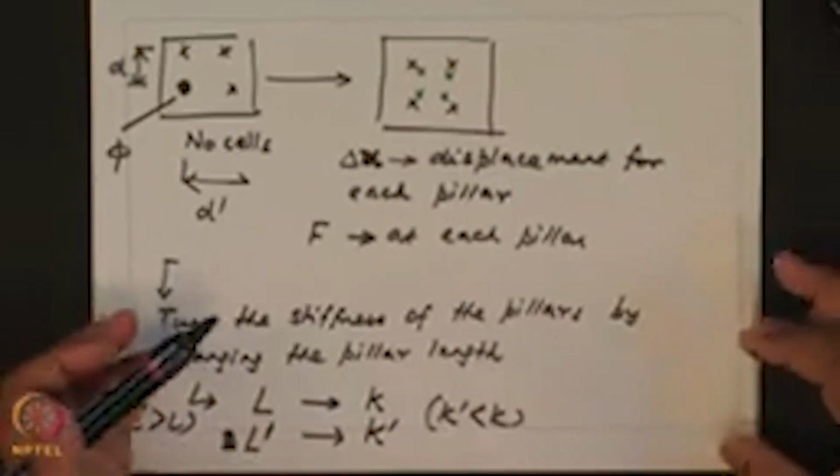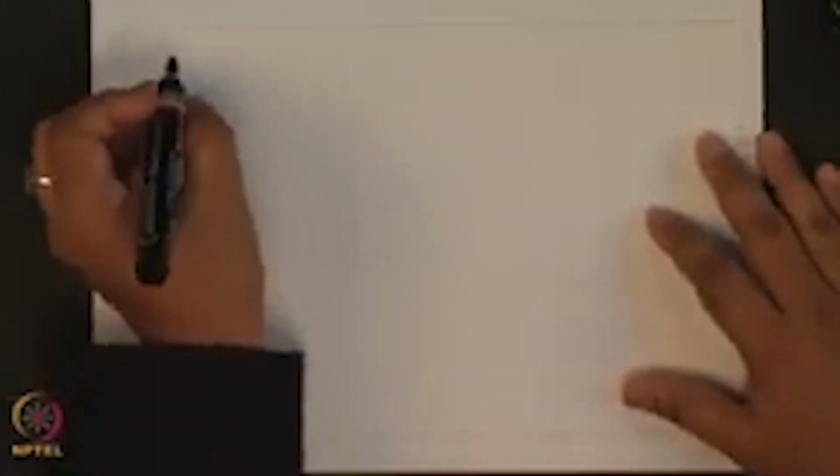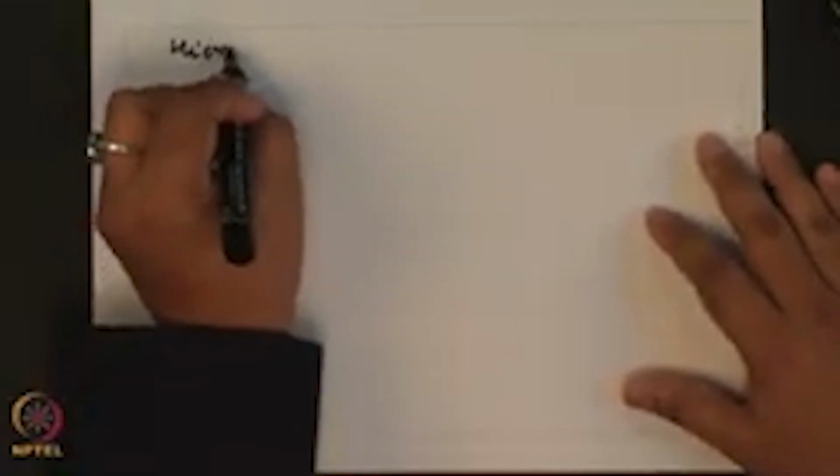Okay. So, this is one of the big advantages of using micro pillars, because you do not need linear elasticity theory to solve the inverse problem for finding out the forces exerted by cells. Here, once you know the displacement, you can exactly map out the force. So, this is one example where microfabrication has been used. The other example of controlling cell shape is using micro contact printing.